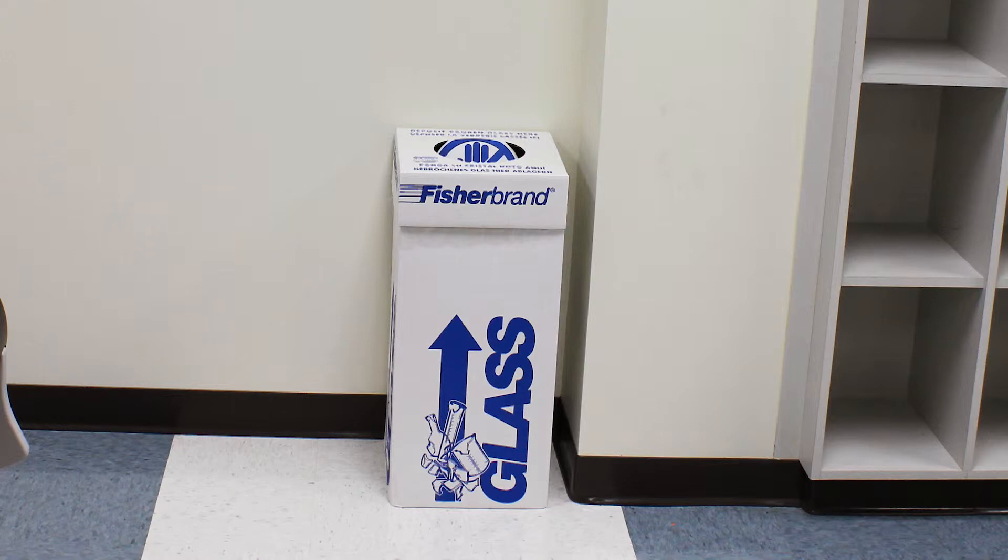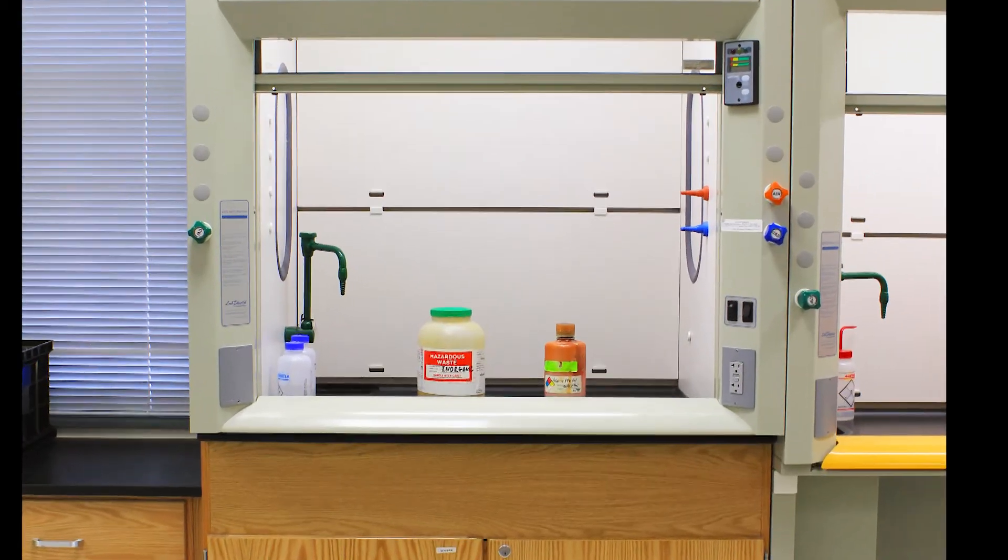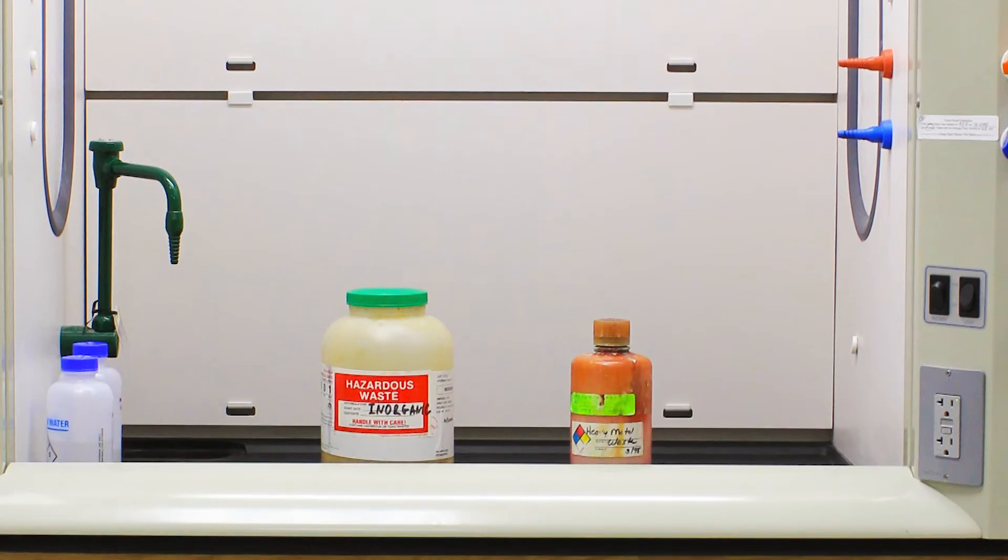There are several types of waste containers that you will be required to know about. Heavy metals such as silver need to be placed in a heavy metal waste container. Note the green sticker indicating the presence of a heavy metal. This same sticker will be on the reagent bottle. Other metal ion waste will go into the inorganic waste container.